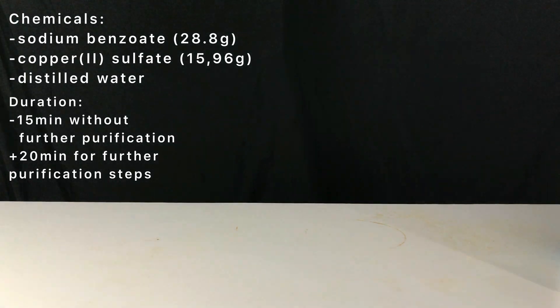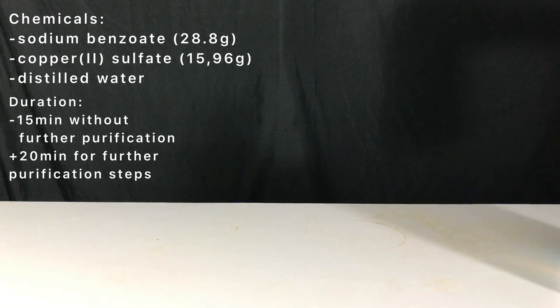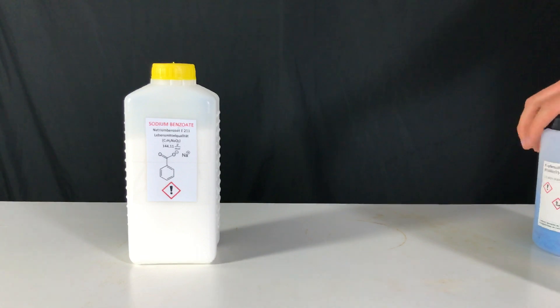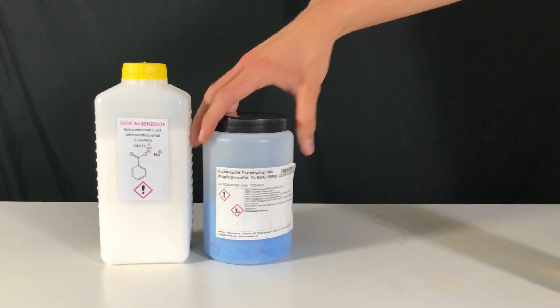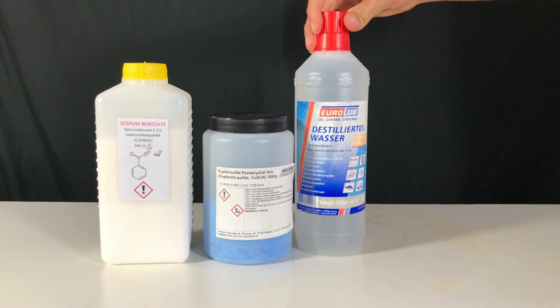Welcome back everyone. Today we are going to make copper benzoate. For this you are going to need sodium benzoate, copper sulfate, and also distilled water.